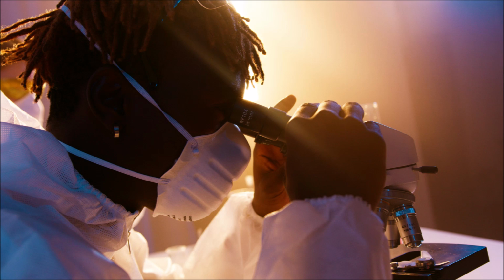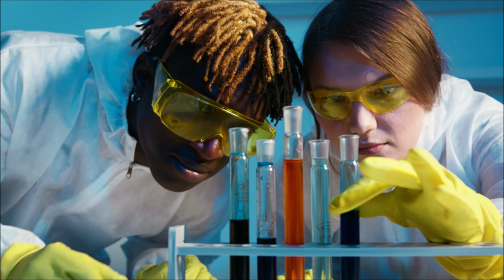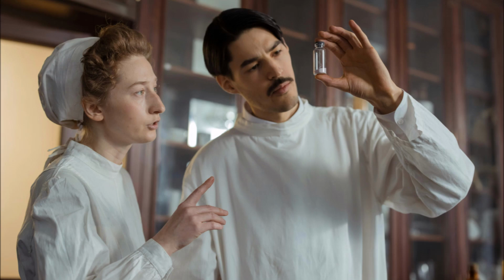Number two thing you need to look at in sampling is the surface sterilization of plant samples. To isolate true endophytes, it is essential to remove surface microbes before processing the plant material.